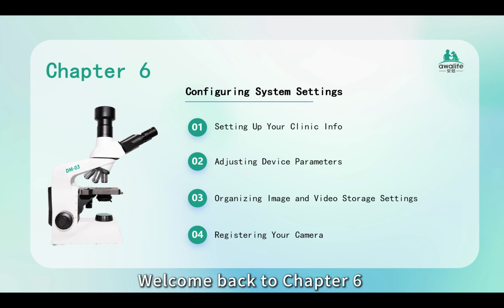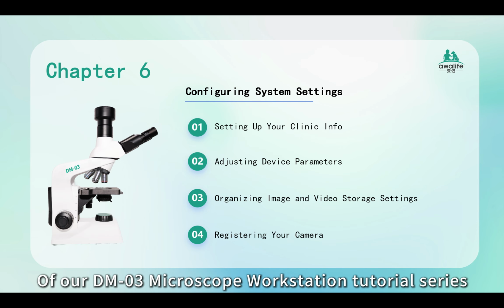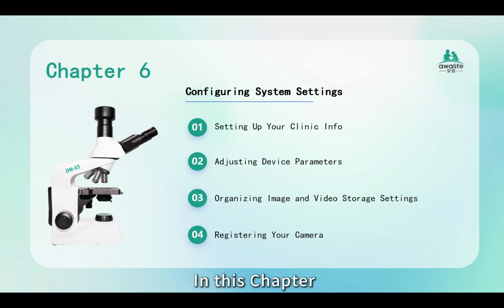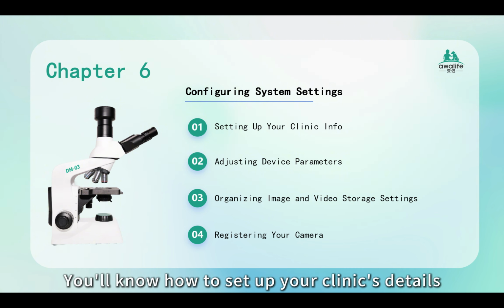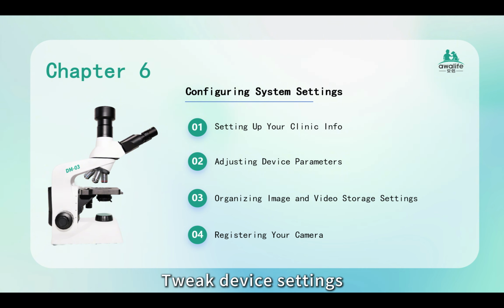Hey everyone, welcome back to Chapter 6 of our DM-03 Microscope Workstation tutorial series. In this chapter, we are going to show you all the features in the system management section. By the end, you will know how to set up your clinic's details, tweak device settings, and manage image and video storage. Let's go for it.